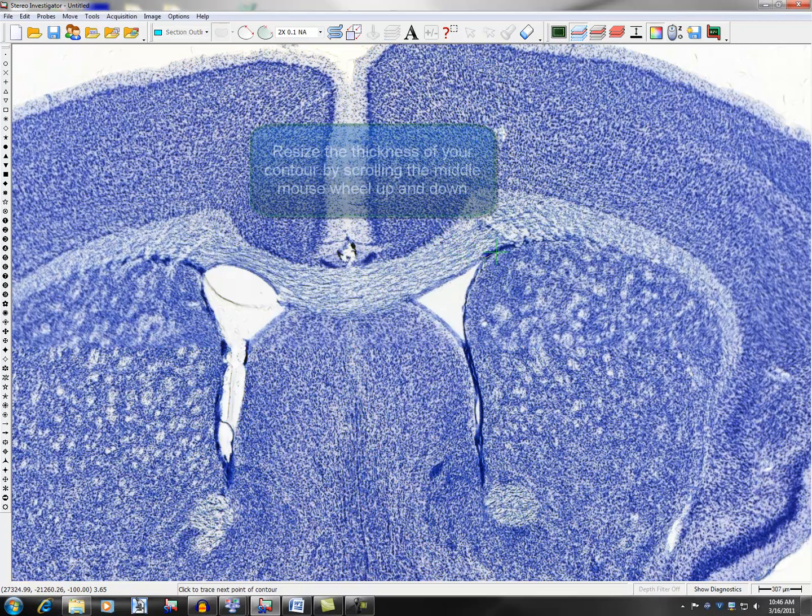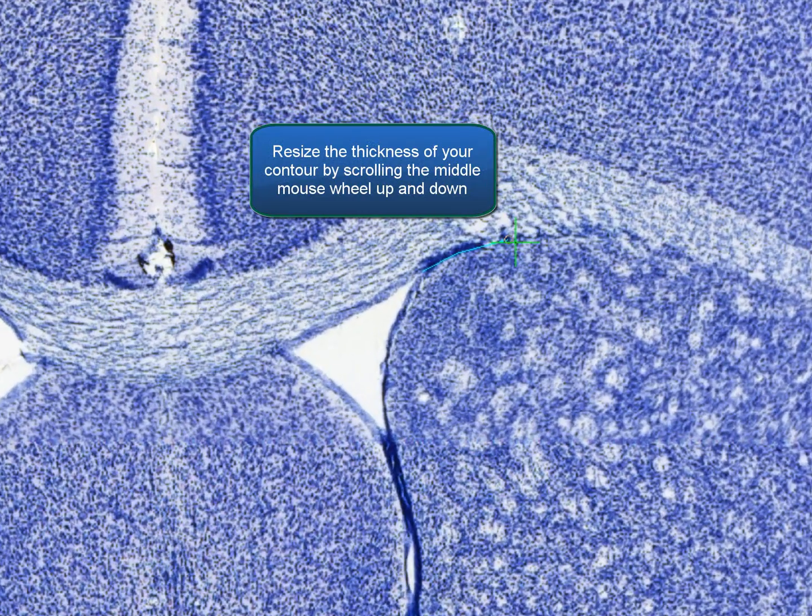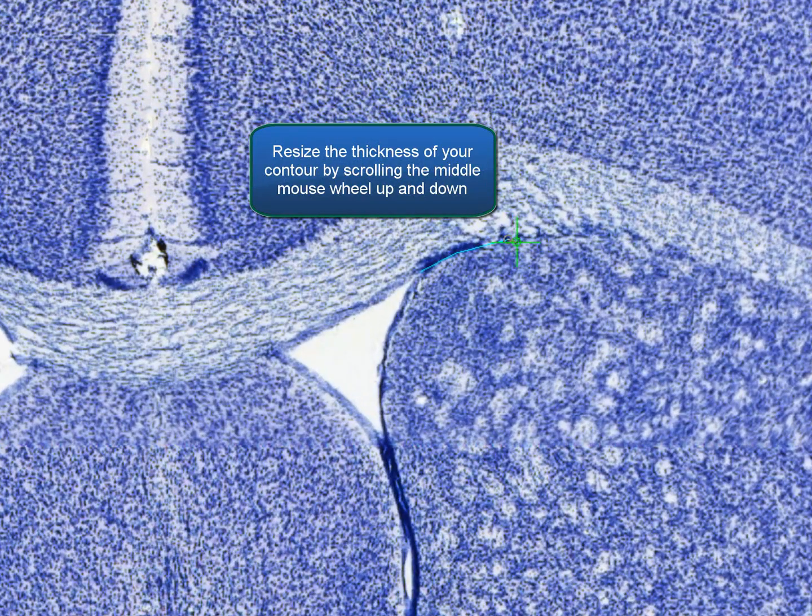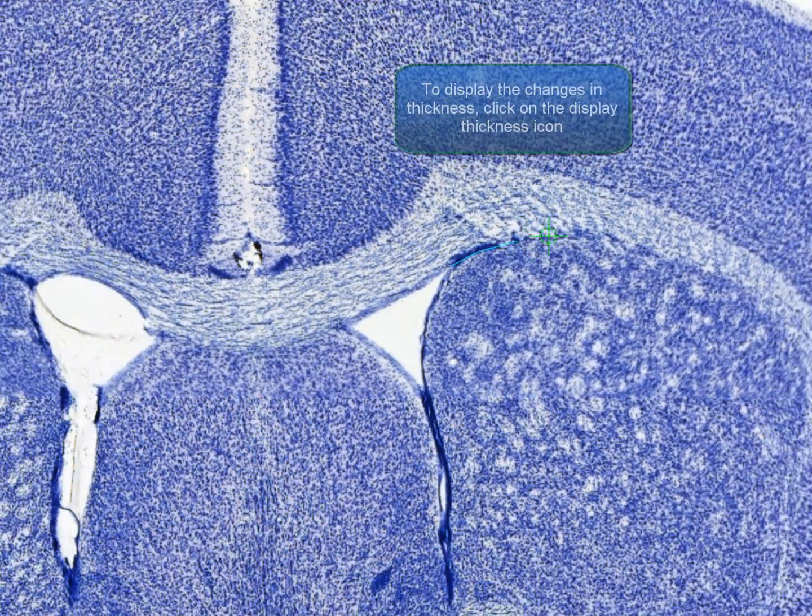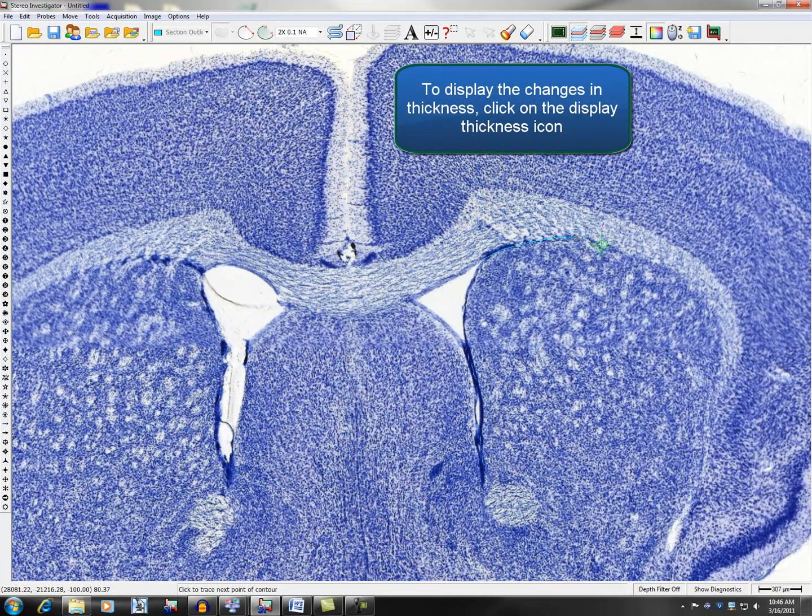To resize the thickness of your contour, scroll the middle mouse wheel up and down. To display the changes in thickness, click on the Display Thickness icon in the Switches toolbar.